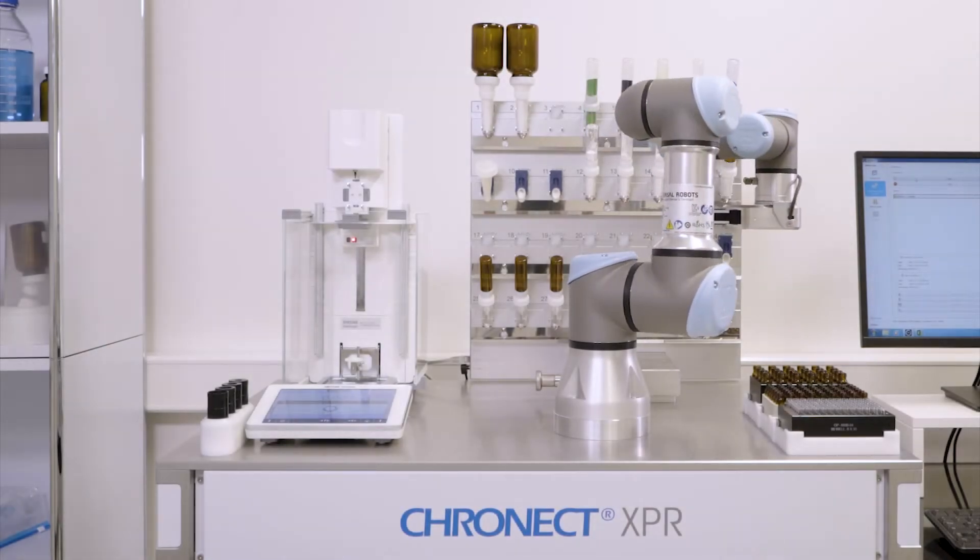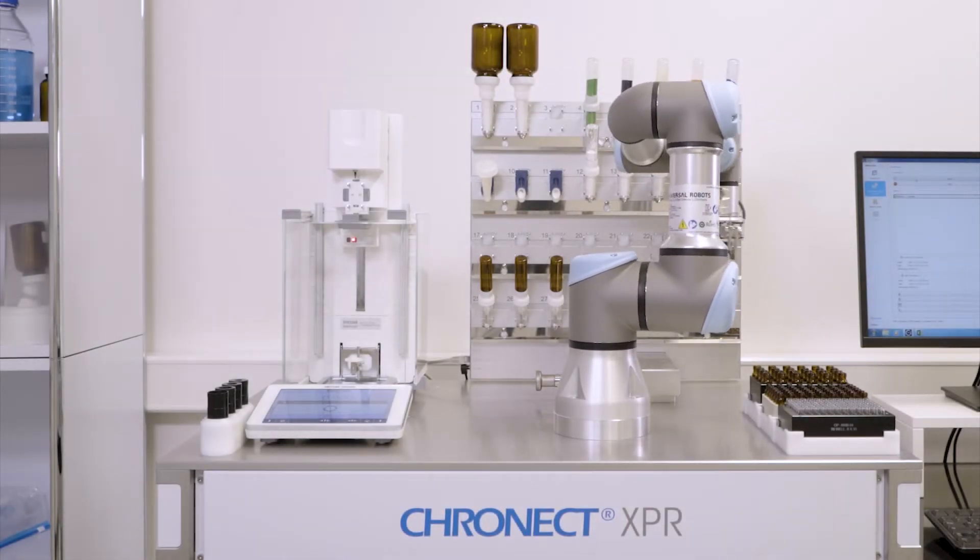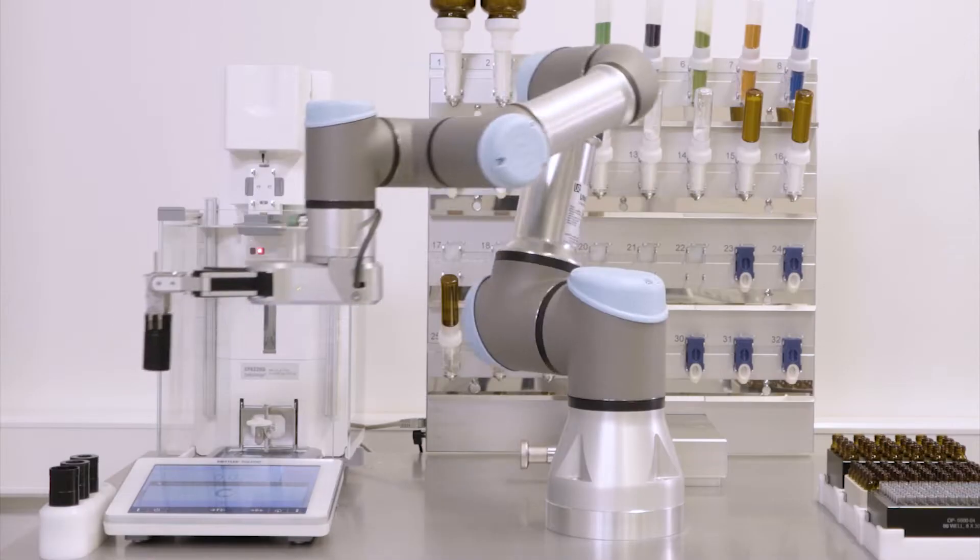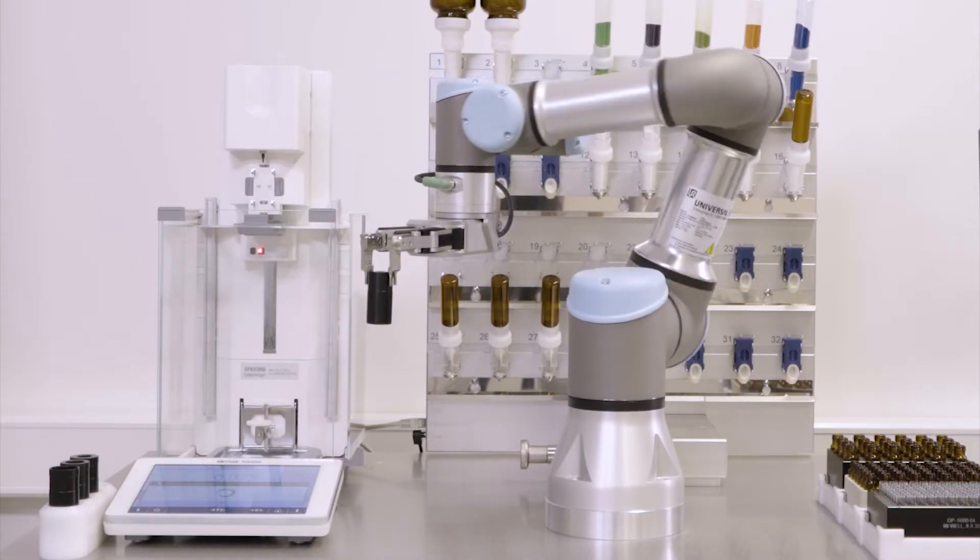The Cronect XPR system combines the advanced weighing technology of the XPR automatic balance with a six-axis robotic arm to enable robotic powder formulation.